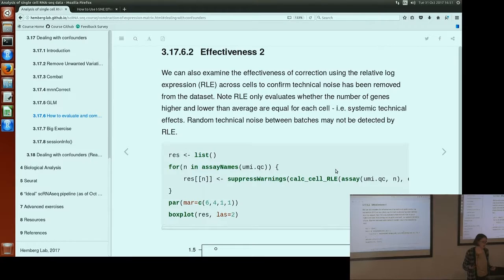And if you have replicates, really only RUVS works well just straight out of the box. You can see the others, we had to sort of break down our matrix and apply them in a sort of weird way, whereas RUVS can handle replicates.